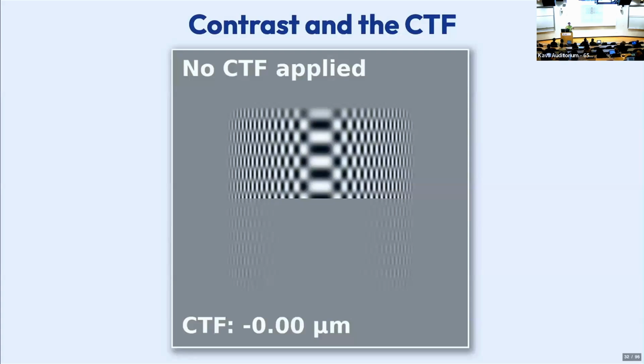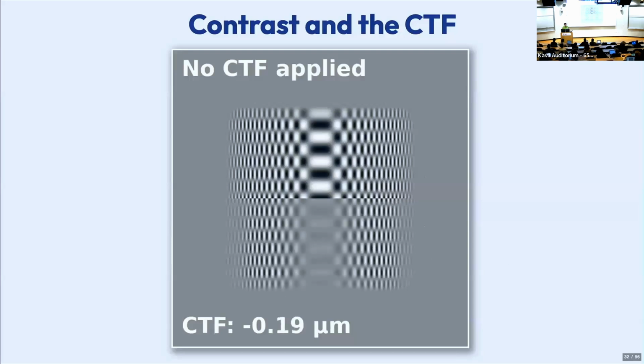I want you to pay attention to two things when the animation starts. One is in the center of the image, where we have the low frequency parts of this grating. I want you to pay attention to what the contrast looks like there. But even more importantly, on the edge here, where we have the high frequency stuff and then no particle anymore, I want you to pay a lot of attention to what happens down here. We can see with no defocus, we can actually see the high resolution stuff a little bit. I'm going to start the animation now.